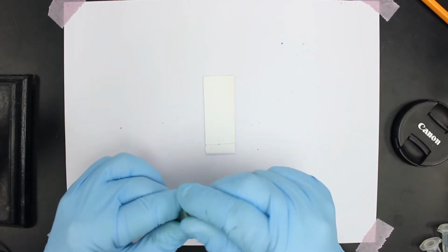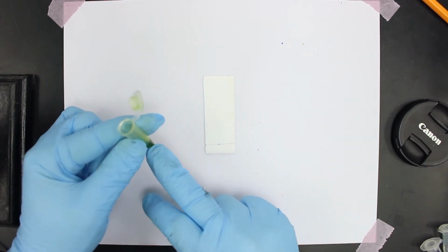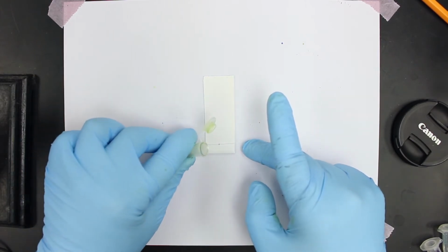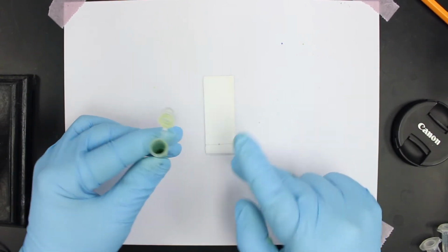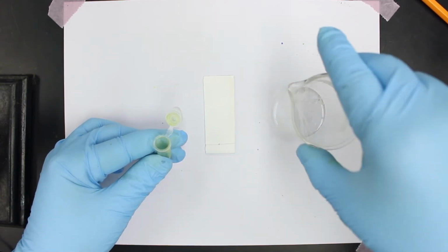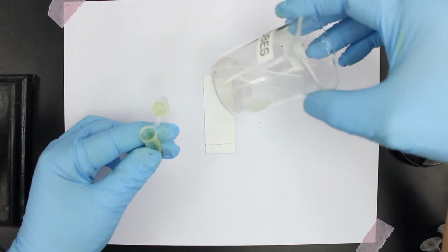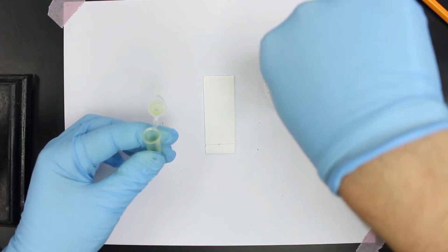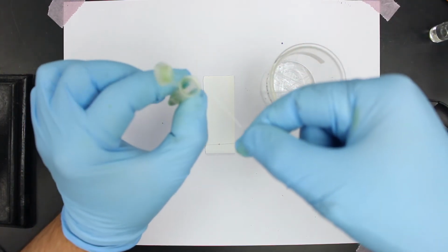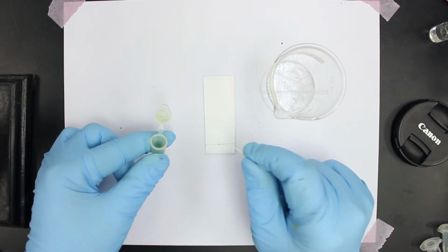So what we can do is we have our mixture, our analyte, to be separated, and we somehow need to apply it to our plate. So obviously we can't just pour it onto the plate because that would be way too much sample. So in order to do that, we need to take a capillary tube, which are these glass tubes, and what you can do is you can take this thin glass tube and dip it into the mixture here, and then you take the capillary tube and then you spot it onto the plate.